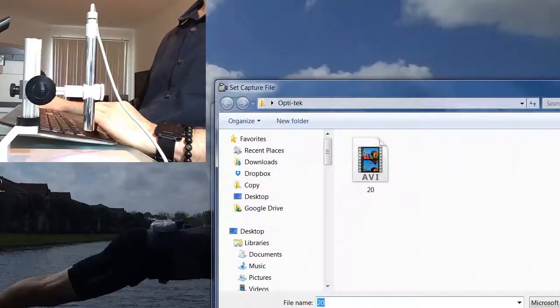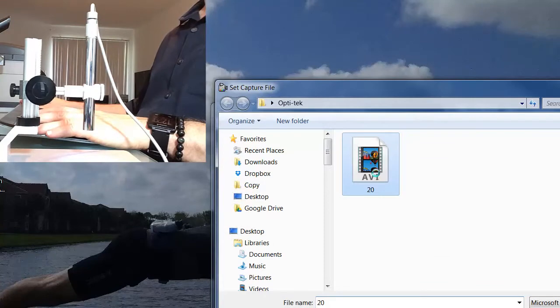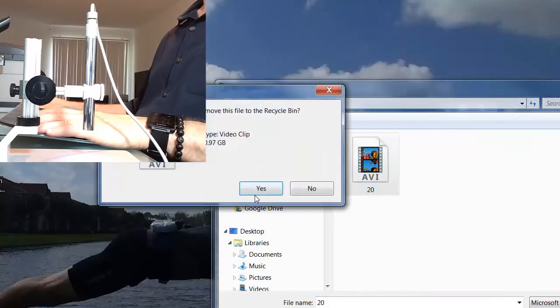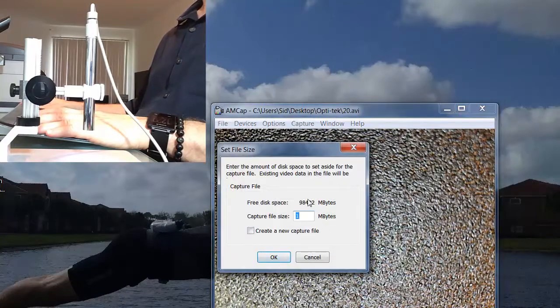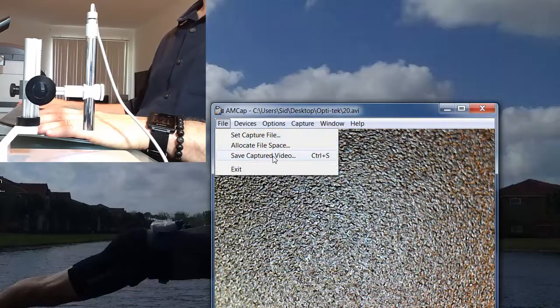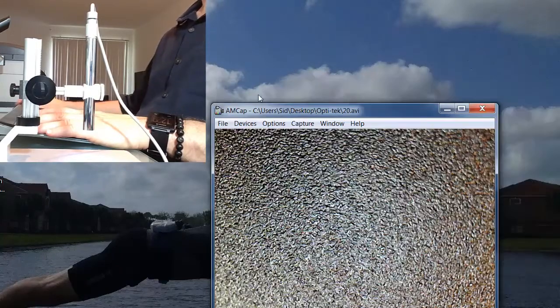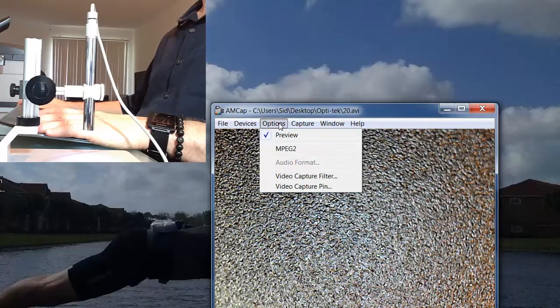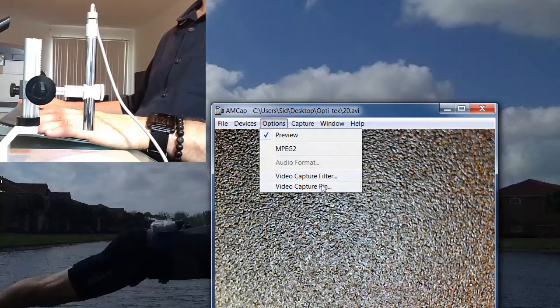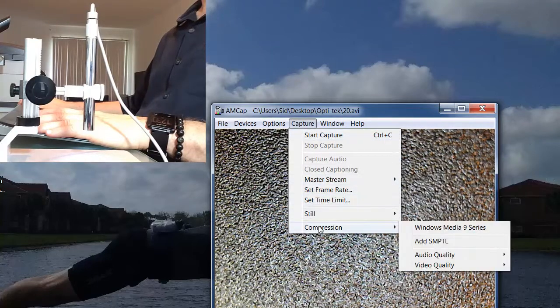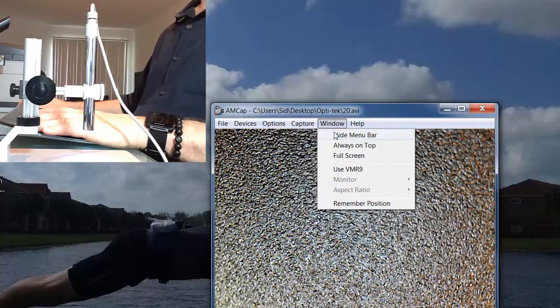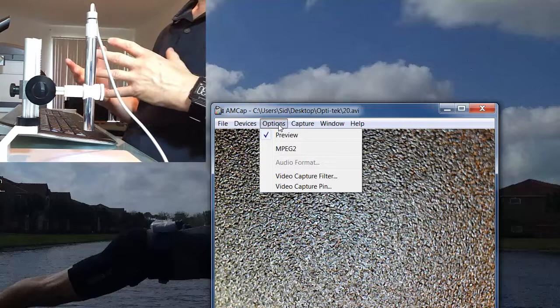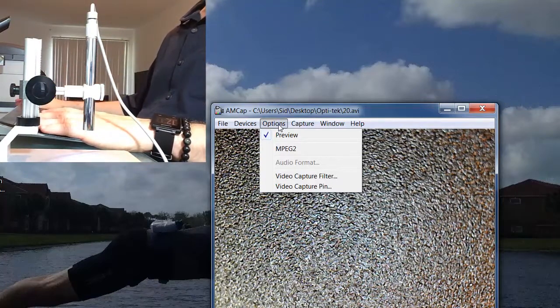You've got multiple options here. You could set the capture file, the folder where you want it to go to. I have an OptiTech folder. You have, you can allocate file size so you can choose that. And then also save capture video. You can choose another folder if you want. You've got devices for the microphone. You can choose what microphone you want to use. You have preview, MPEG, video capture filter, PIN. You can adjust the quality of the compression windows. There's a lot of different options here. As you have an opportunity to use the microscope, you'll be able to choose the options that fit best for you.